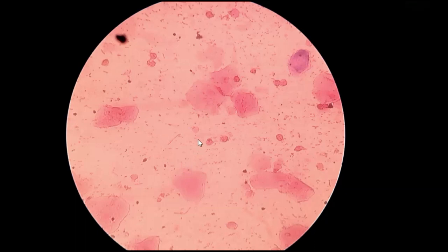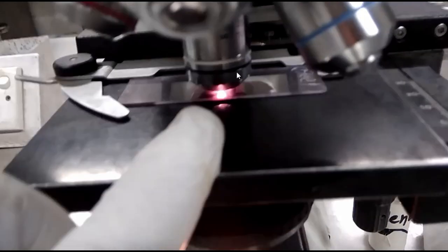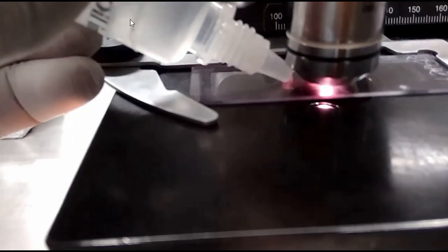Now try to cover 100x. Yes, shift to the 100x objective. This is also called the oil immersion objective. So there is a need for oil, that is called cedar wood oil. This one.